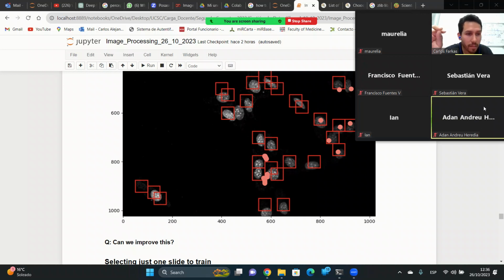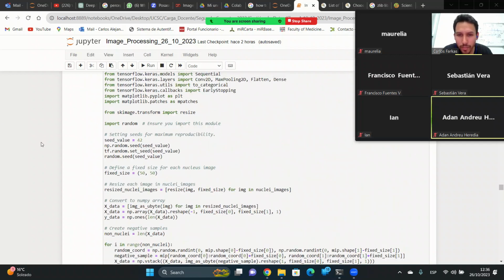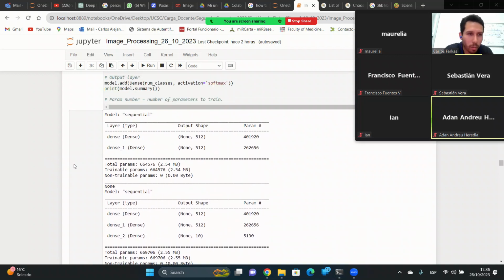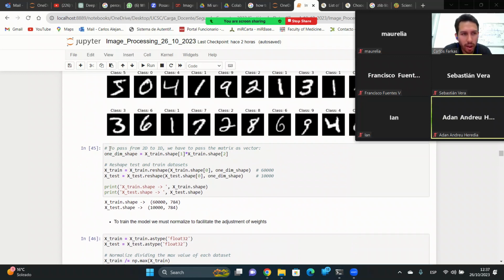You can see this is a very bad behavior, but what if you have a set stack of 100 images and 100 set stacks? Good luck with counting nuclei. Okay, so we'll see that in the next class, and I will encourage you to try to apply your data with some microscopy images if you have them beforehand.